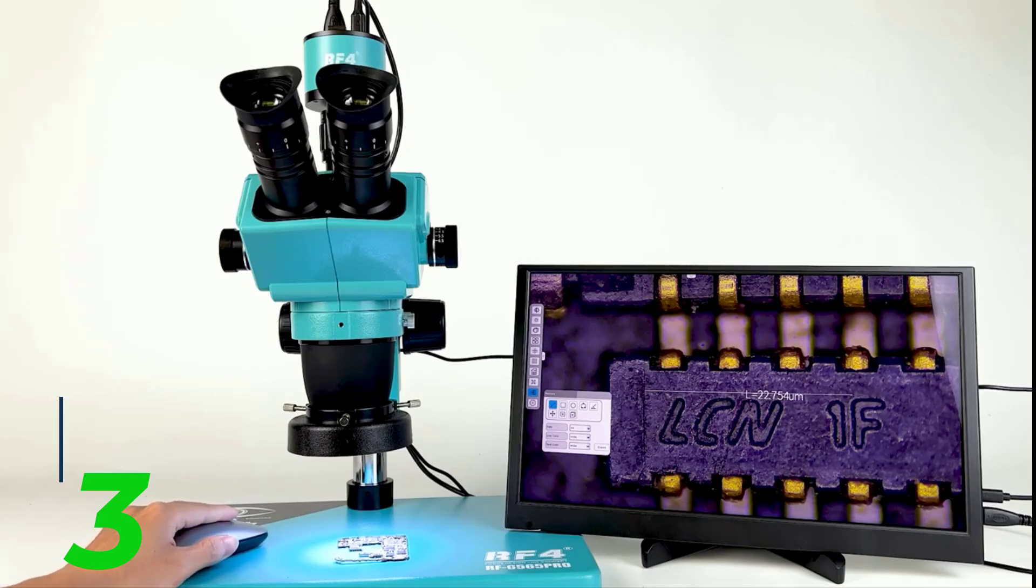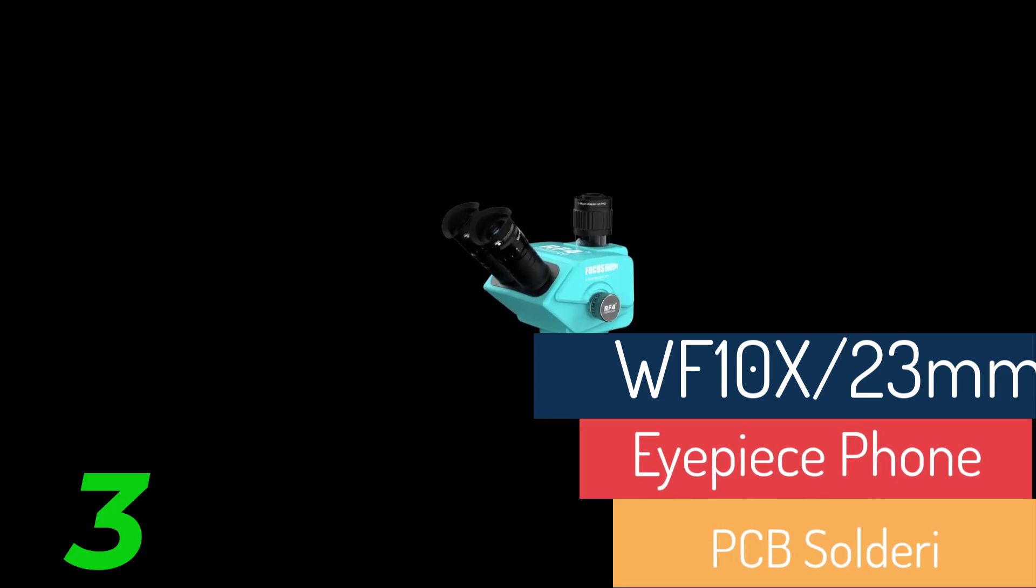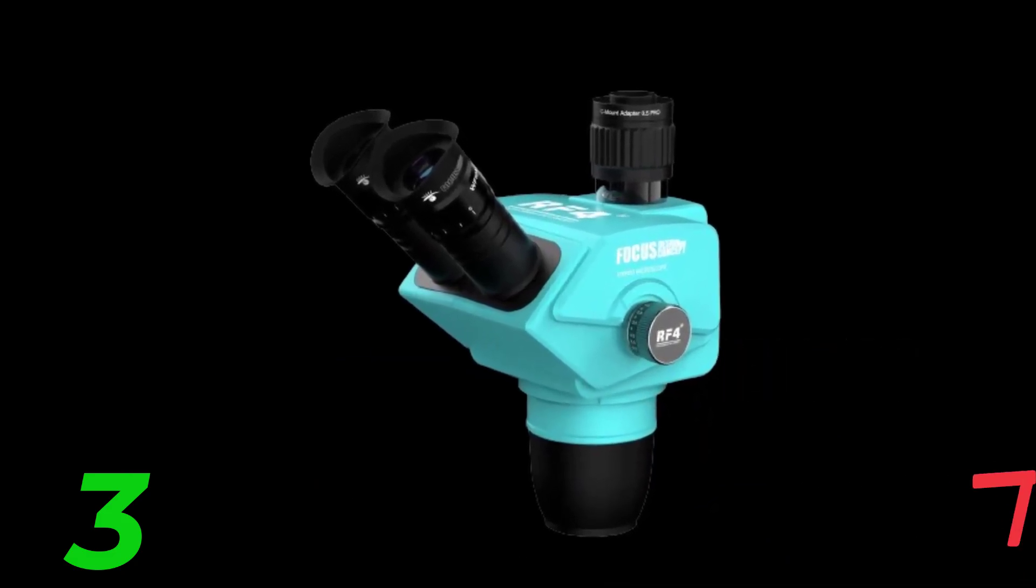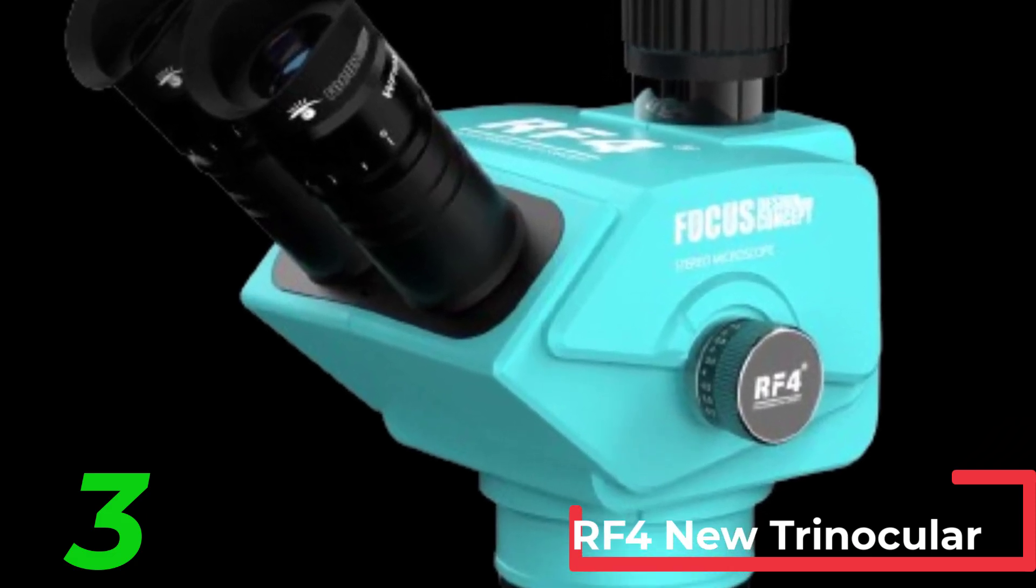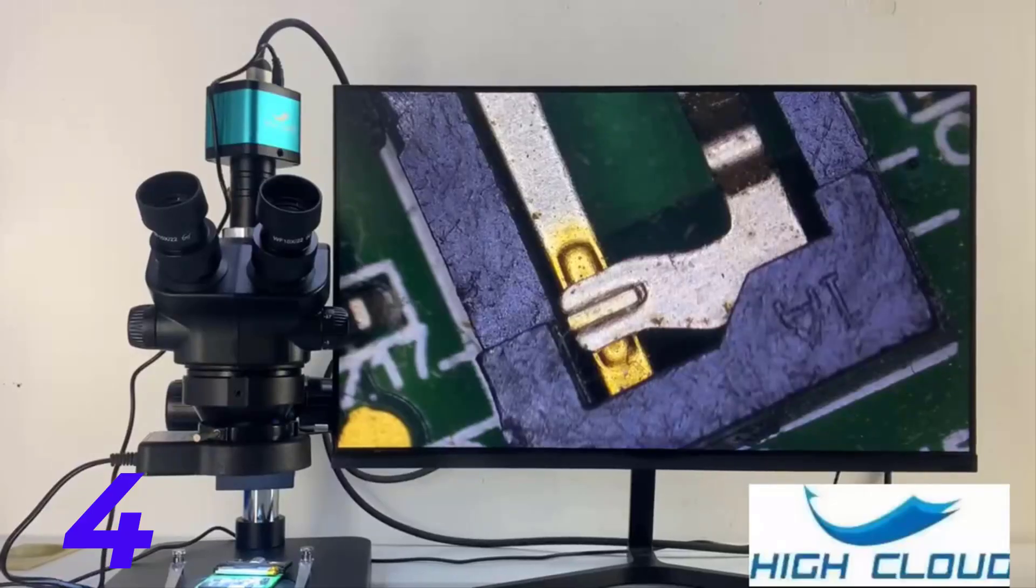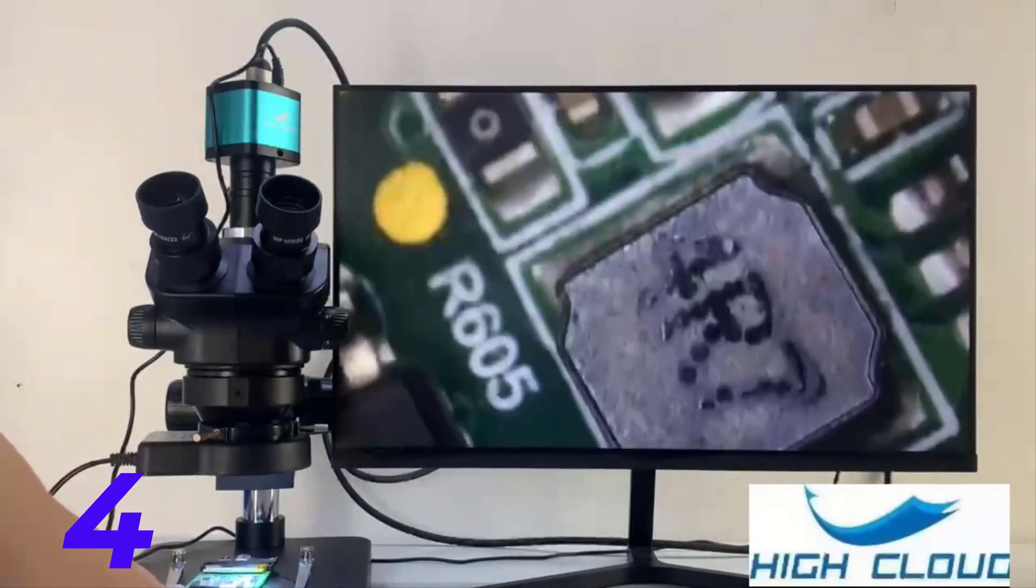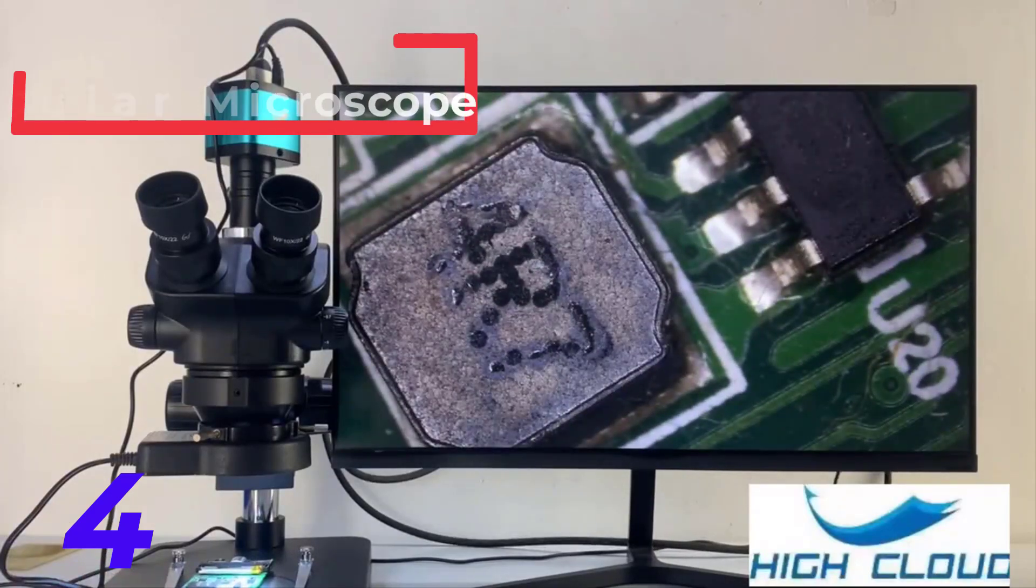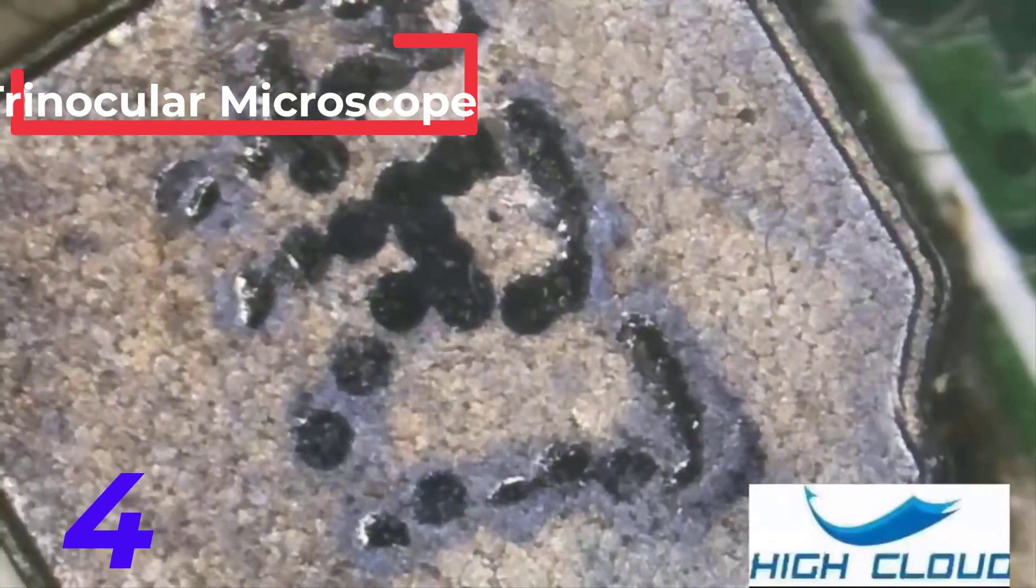Exploring the 1080p 48 Megapixel 2K 4K HDMI USB VGA Video Camera Microscope Set. In the world of precision electronics, biological research, and various industrial applications, having a reliable and versatile microscope is essential. The 1080p 48 Megapixel 2K HDMI USB VGA Video Camera 50x-100x Simul Focal Stereo Trinocular Microscope Set offers an advanced solution for professionals in these fields. This comprehensive set combines high-resolution imaging with a range of connectivity options, making it a versatile tool for detailed observation and analysis.